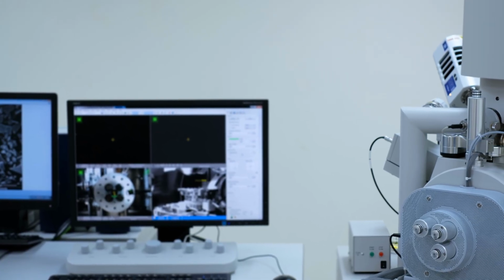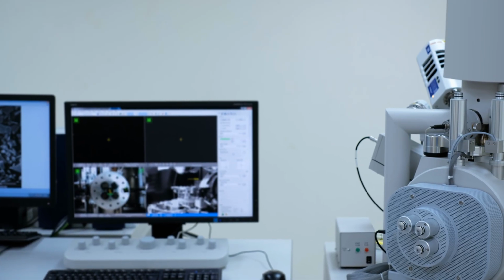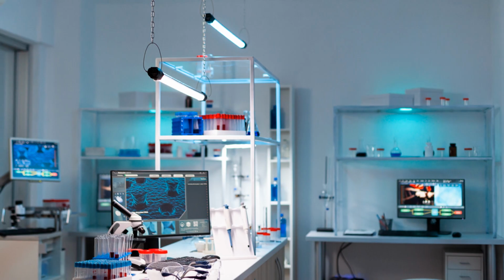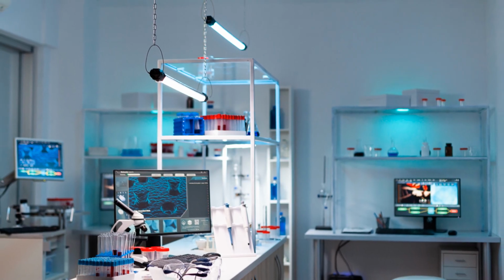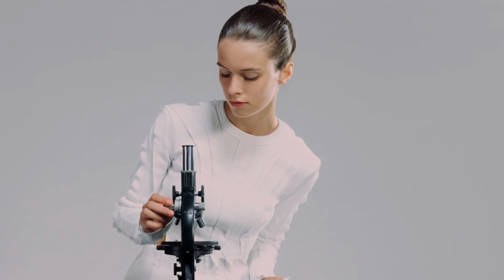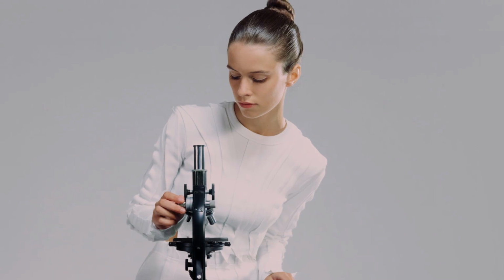The electron microscope didn't replace the light microscope. It complemented it, launching science into the nanoworld. Section 6. Pushing the limits. Modern microscopy marvels. The world of microscopy is not standing still.